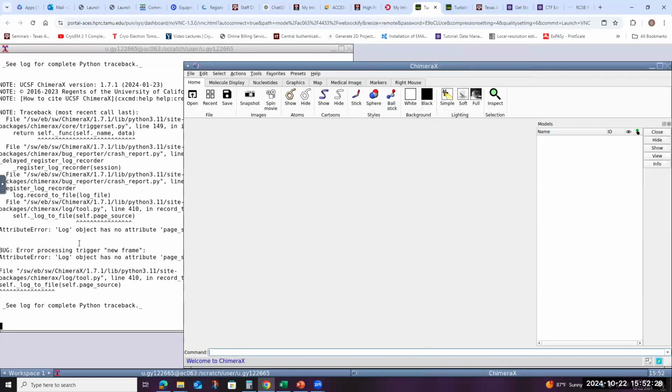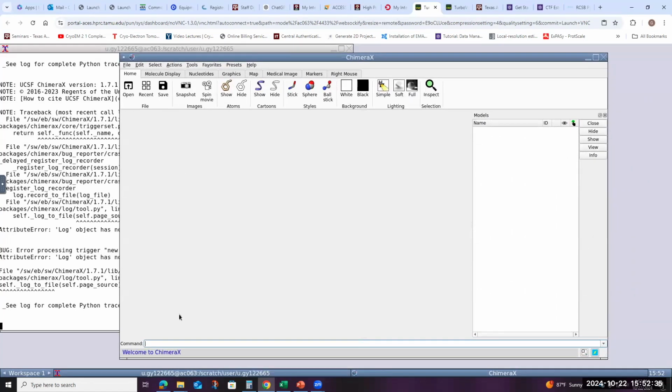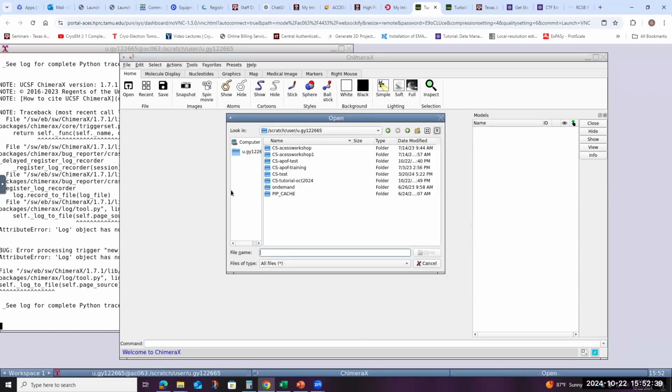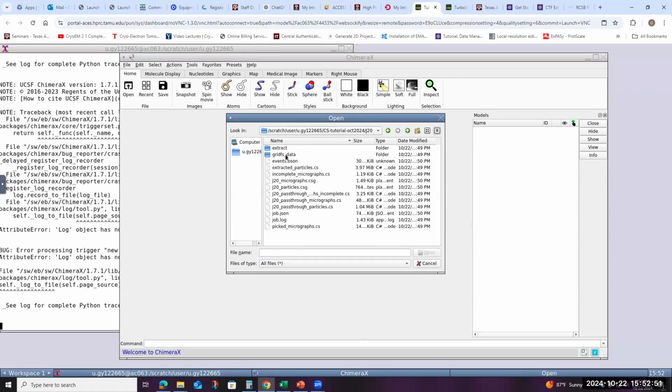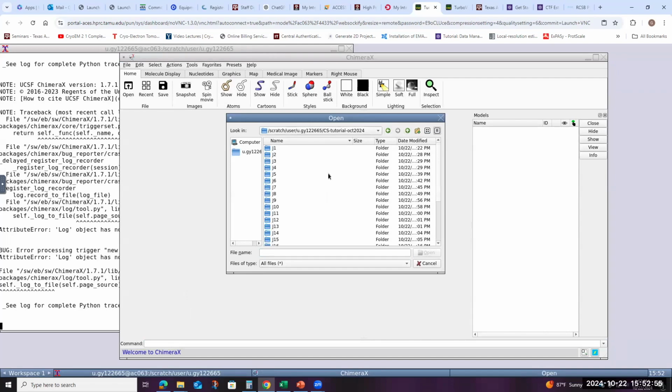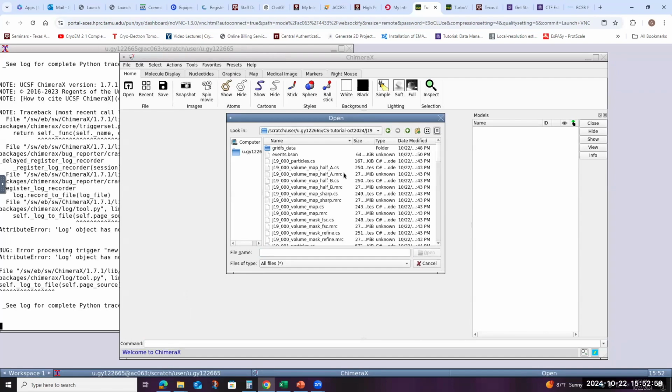Yeah, you can. There is ChimeraX installed on this. You load the module for ChimeraX, and then you can open the map. So you can see here, today's one, job number 20. Not 20, but 19. You can see here we have the different maps.